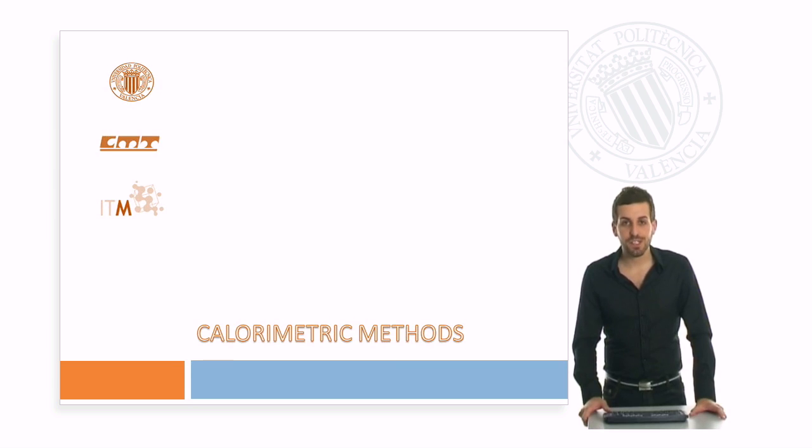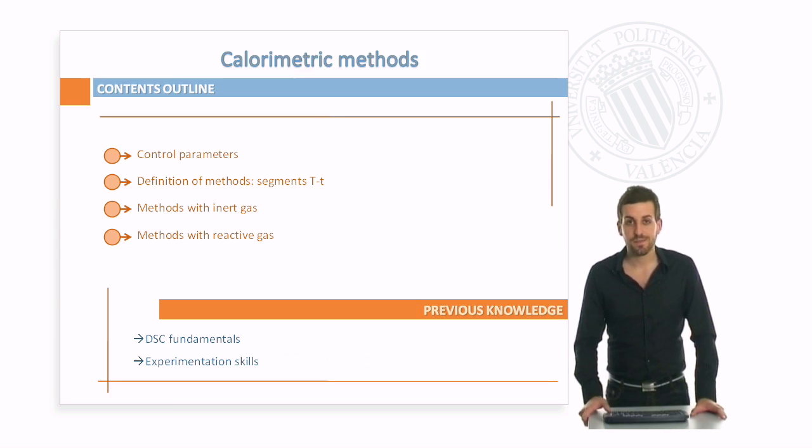Welcome to this new presentation regarding differential scanning calorimetry. In this one, we are going to learn how to design good methods to perform good experiments. This is our contents outline.